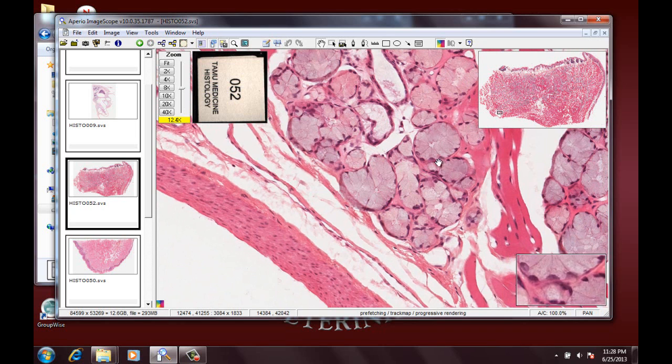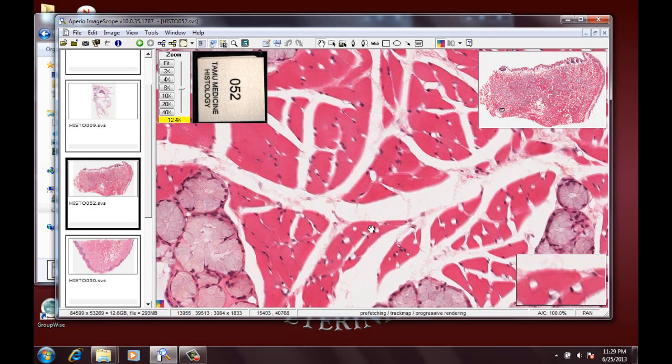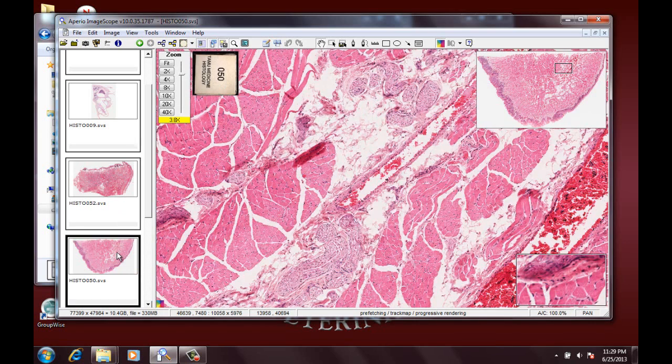These are the mucus secreting cells with a flat nucleus in the surface, and you can see again, if you look over on the right hand side, you'll be able to see the columnar type cells that we see there, and these little capillaries associated with them. If you want to look at a different piece of tissue, come over here and click.